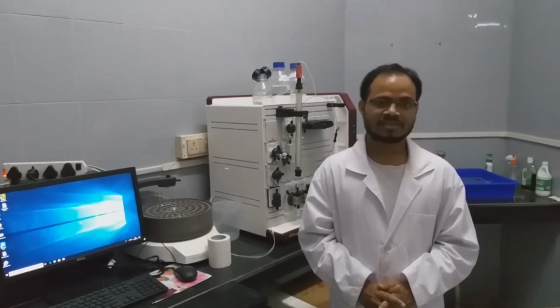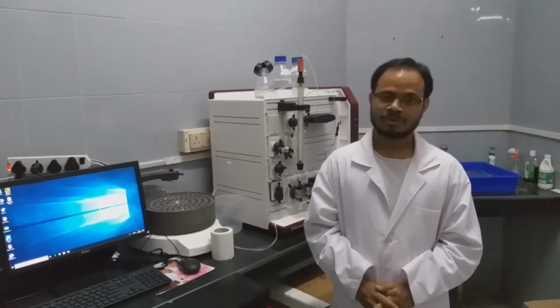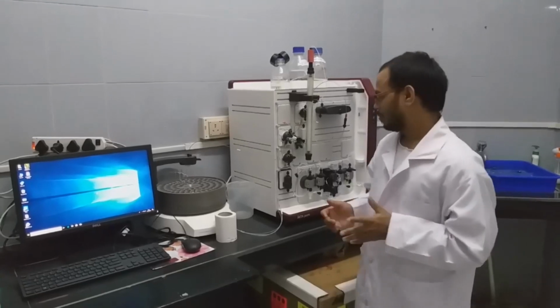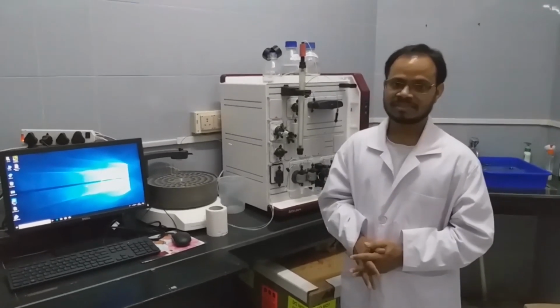The details of size exclusion or gel filtration were shown in a previous video. In this video we will show how this instrument can be operated. In our lab we are using the ÄKTApure. This is from GE Healthcare.